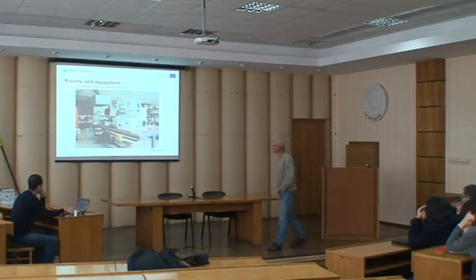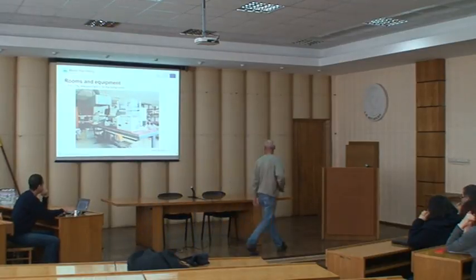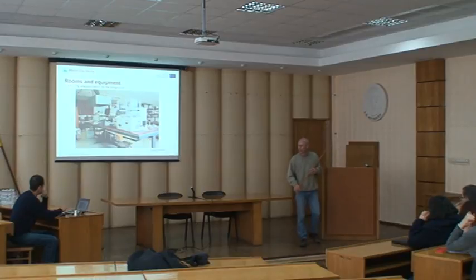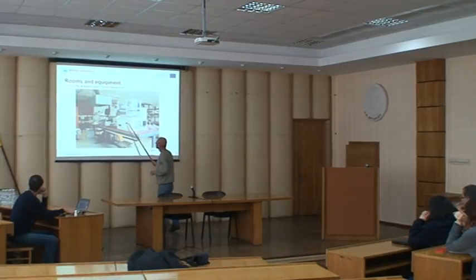So this is an analyzer for the determination of TIC and TNb, total nitrogen bound, and this is pretty new.